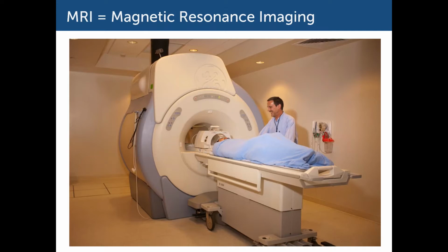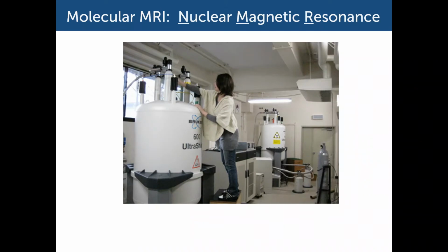So this is a picture of a simple looking MRI instrument in a hospital. One of these instruments will typically cost about $4 million to install. That's pretty expensive. NMR looks a little different. So this is a nuclear magnetic resonance instrument at a university, not LMU. We do have an instrument, but it's not these. And so you can see that this looks very simple relative to the MRI, in part because patients aren't going to see this. It doesn't need to look fancy.